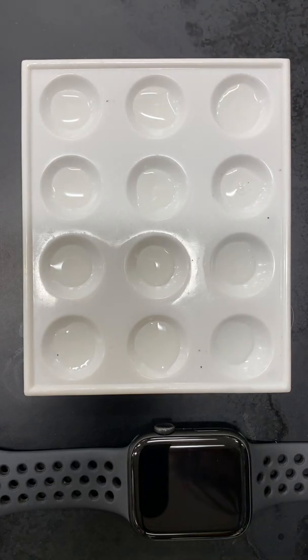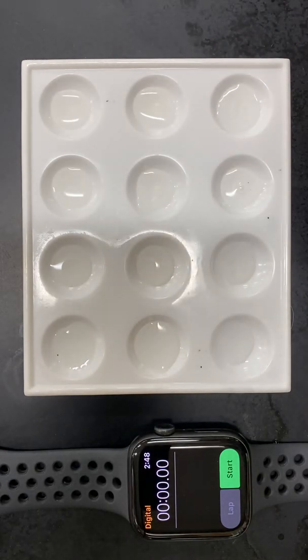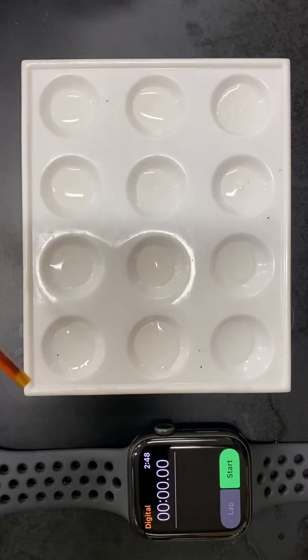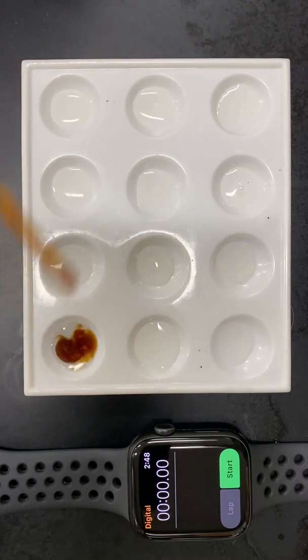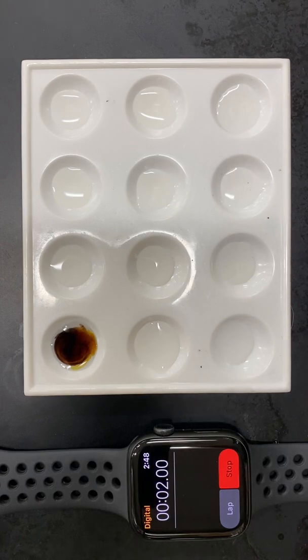Okay, and now that I've added the 1 drop of starch, I'm going to add iodine solution at a time mark of 0. So here's my first. So that's my time mark of 0, and now I start timing. Now we have to wait 30 seconds, and after 30 seconds, we're going to add the iodine indicator solution to the next well spot.